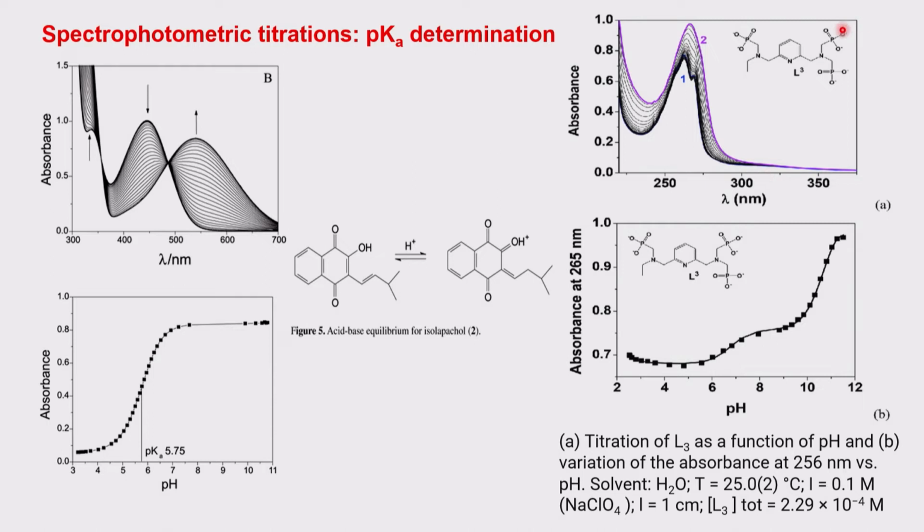You have one phosphate over there, another phosphate over here, and another phosphate. You can get even 3, but you get clearly only 2, but not the 3 in this particular case. So you can see this is also done. You take this particular ligand, start going from acid towards the base, kind of acid base titration. It's a little broad.